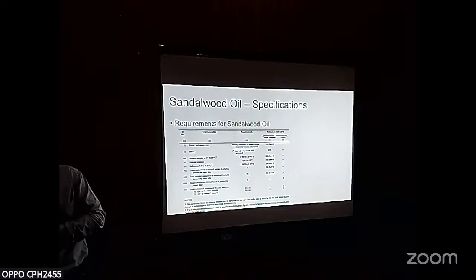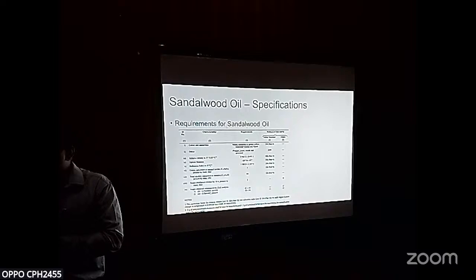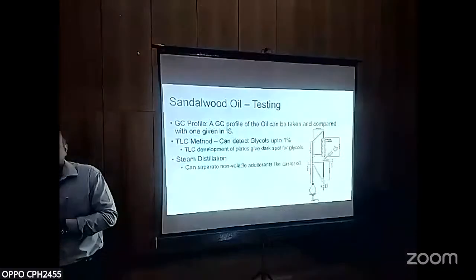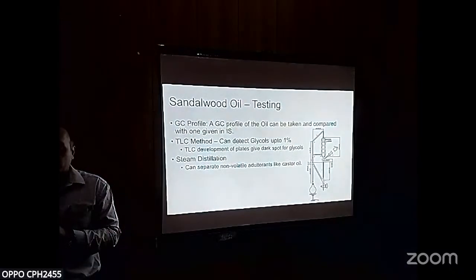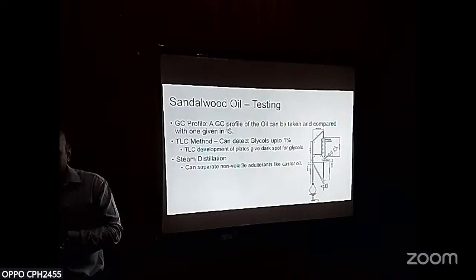If I have to name some French perfumes like Davidoff and all, you get very unique notes. How does that come? Because of some very critical ingredients which are over here. And the other parameters are pretty easy for you to look into. Then I just give you a brief distillation equipment setup, wherein an end user will be able to do it. So what BIS tells is normally to separate the major adulterants and identify them.